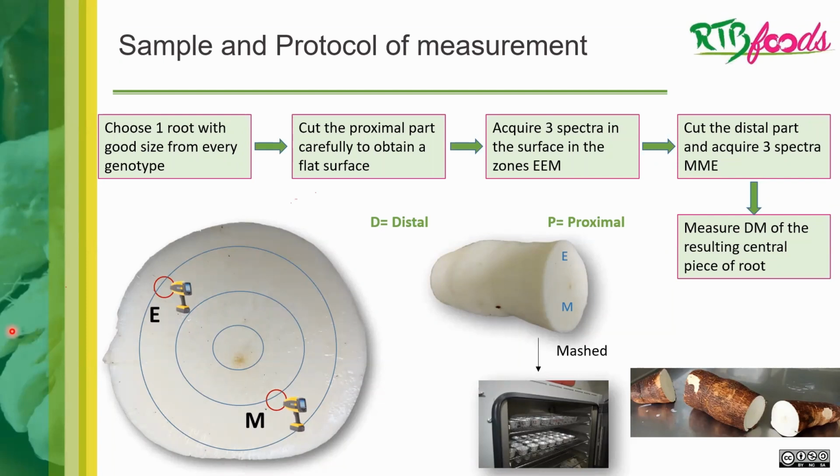Can I say something? So we're talking about holding this quality spec in the field. I think when this equipment first came, it was Ugochukwu who used it. He carried it with his hand to take all the samples. So I think it's doable, but it's really stressful. When I started taking my own data, we had to use a table. We got a shed and used a flat table, and we collected our samples outside the field but within the field area. So there was a shed, and we put the spectrometer on the table and then collected our data, but taking it in the field is very doable. That's just my contribution. Thanks a lot for the feedback.